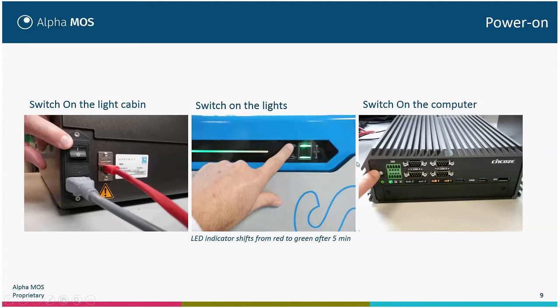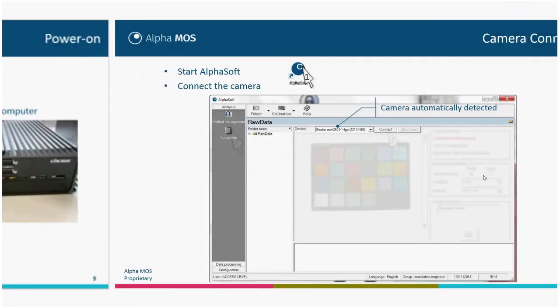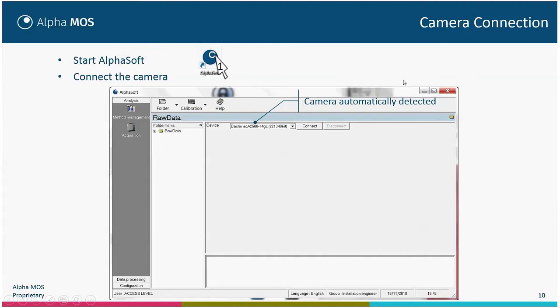The LED will be red first and will turn green after five minutes, but even before five minutes the light can be stable. Then you can switch on the computer with this button. One of the first things to do in AlphaSoft — when you open AlphaSoft, you double-click on the AlphaSoft icon, then go to Analysis > Acquisition, and the camera will be automatically detected using an Ethernet connection.